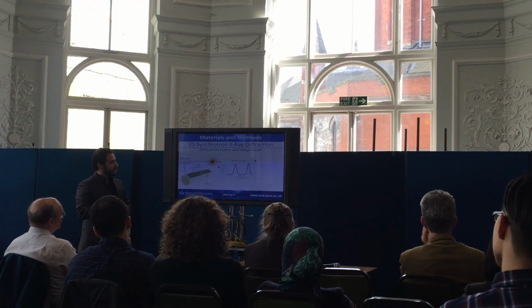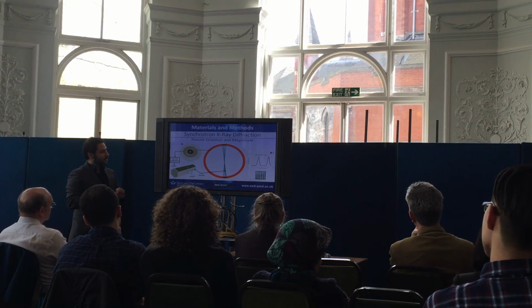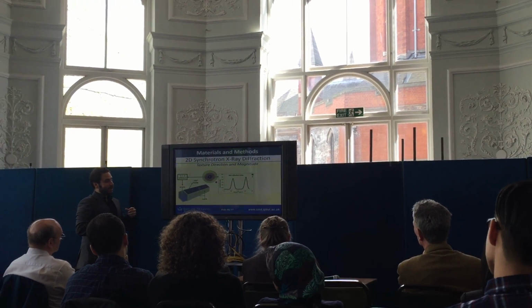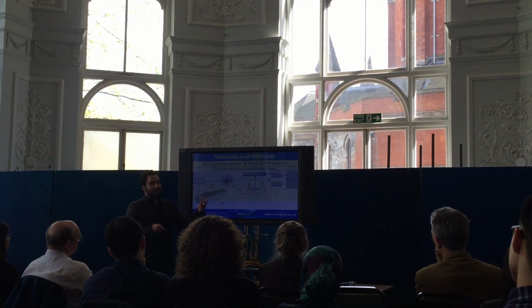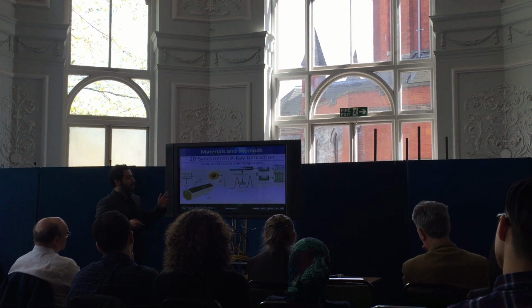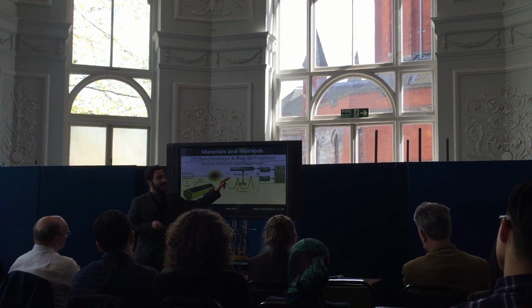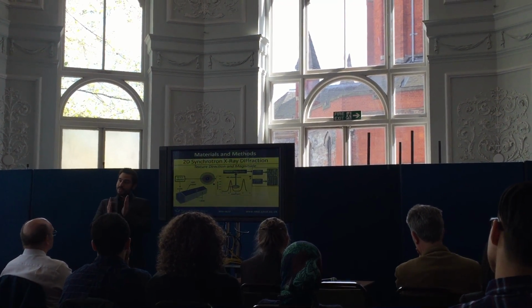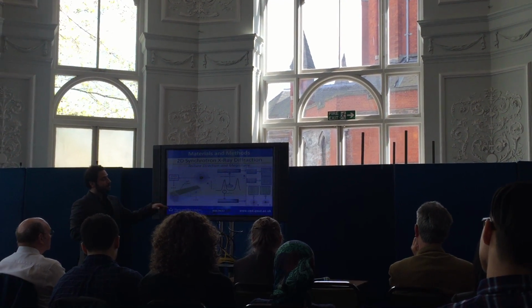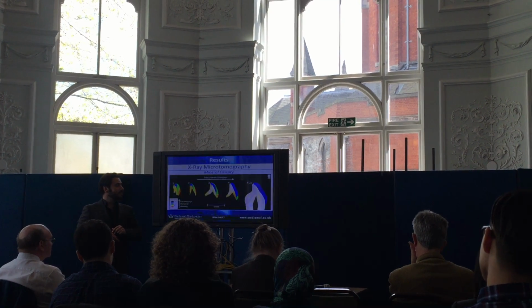When it's more aligned, the peaks are narrower. Remember this point. From this kind of curve, we can get 2 kinds of information. The first one is we can measure the full width half maximum to get the texture magnitude, and the second type of data is the texture direction from the peak's position.